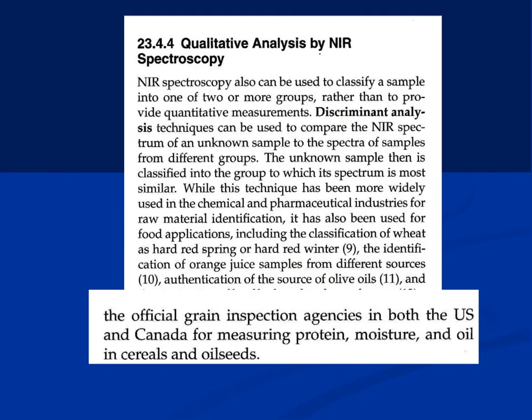Every kind of molecule or food product has its own fingerprint, and if you know the fingerprint of your control, then you can compare and say if olive oil from California has a different fingerprint as compared to that from Spain or from Europe. So you can compare those two oils and maybe even distinguish how much contamination is present in there.